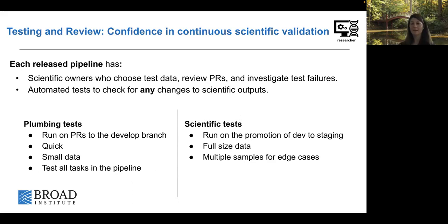for running. Okay, I'll just pause there and see if anyone has a question. I hope I'm not moving too fast.